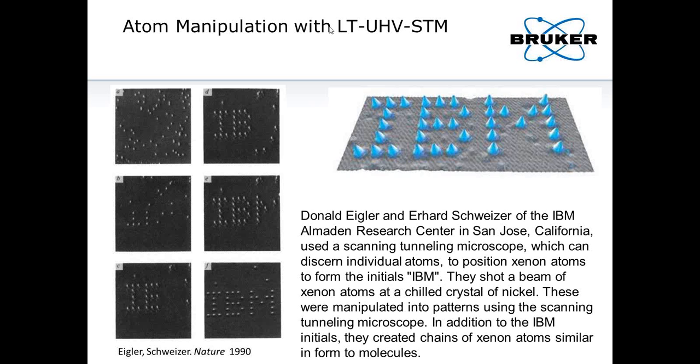This is done with a low temperature, ultra high vacuum STM. In the first image, those white dots are xenon atoms on the nickel surface.